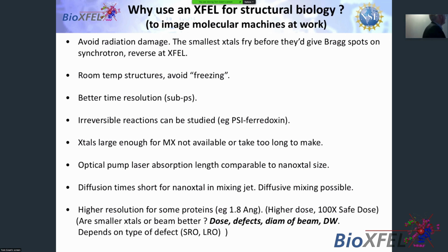Very important point. And finally, in some cases, this is still a bit anecdotal, but certainly if you talk to Axel Brunger, you'll find he believes that the resolution is better at an XFEL. Now, the reasons for that are very complicated. They'll depend on the particular protein, its defect structure, the dose you use, the diameter of the beam, the B-factor, and other things. So it's a complex problem.